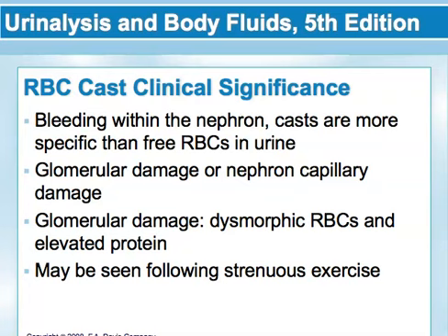If excessive hemoglobinuria or myoglobinuria is present, you will see more uniform casts that are more of a granular dirty brown. This version of the red cell cast is associated more with tubular necrosis that comes from massive hemoglobinuria and can lead to renal failure.